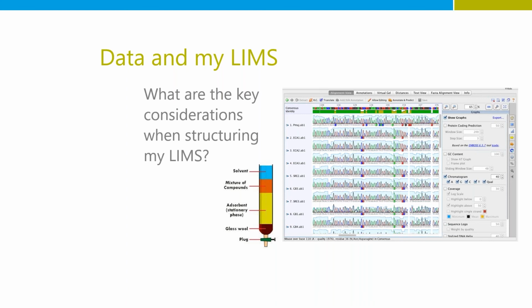And then the next part is, what is your business model? What are you trying to accomplish? What are your customer facing needs? And so you can start to gauge what is a real ROI. I always suggest picking systems that have a high level of extensibility. You need to be ISO 17025 compliant. There's a lot of other access controls, security. It's all about picking a product and a solution that's right size for your organization.